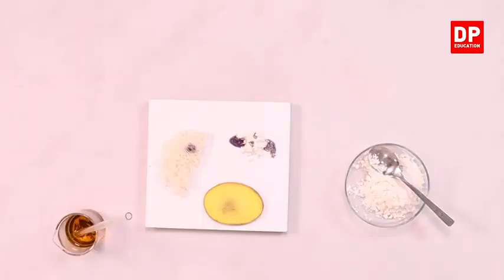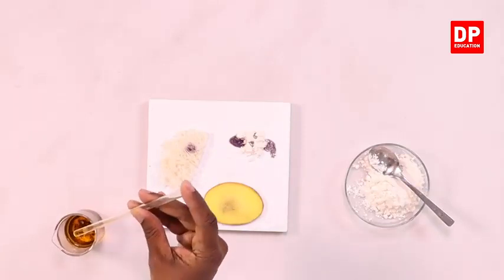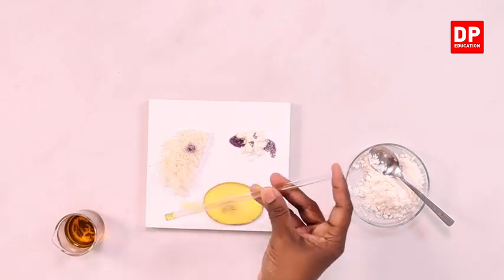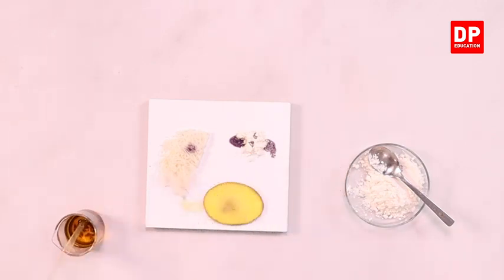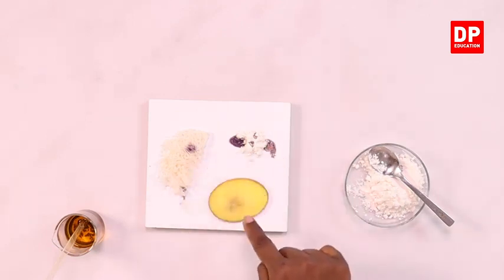To show the difference between the normal color of iodine as well as the color change with starch, I will put a few drops of iodine on the tile. You can see students, a light reddish brown color. At the same time, with the 3 samples, you can observe the purple color. So you can see the color change very clearly.